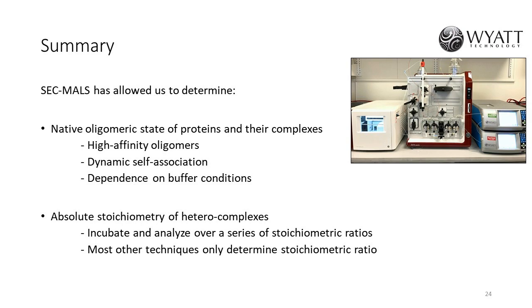Okay, thank you. Another question for you. How have the absolute stoichiometries determined by SEC-MALS informed the interpretation of crystal structures of these complexes?